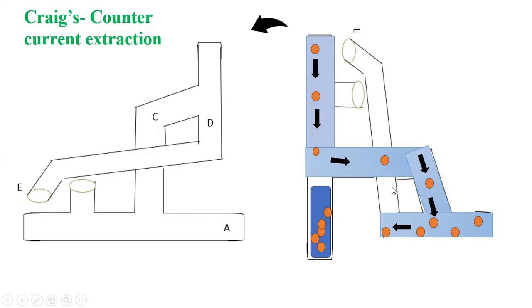All the contents are to be moved in this one direction. From this tube, initially the contents are there. Now when you invert this one, the contents are transferred through this one. Now just see here, the phase interface comes, and these dissolved chemical components move in this way, okay. Likewise, the contents are moved in this way. There is a separation if the interface occurs, that is, the polar phase and the non-polar phase.